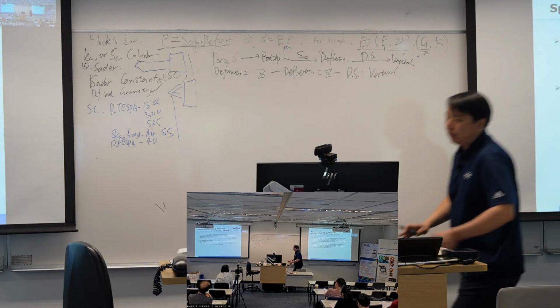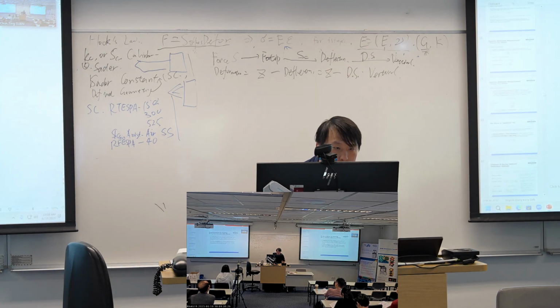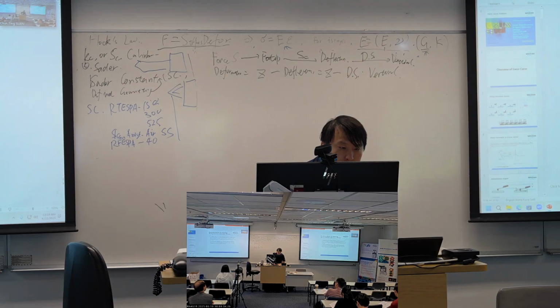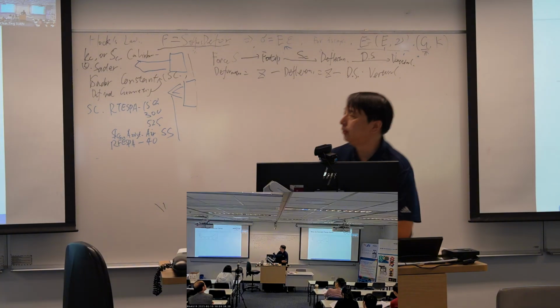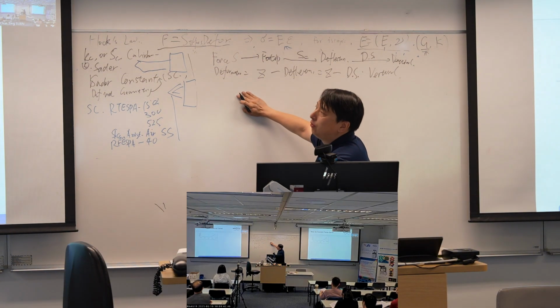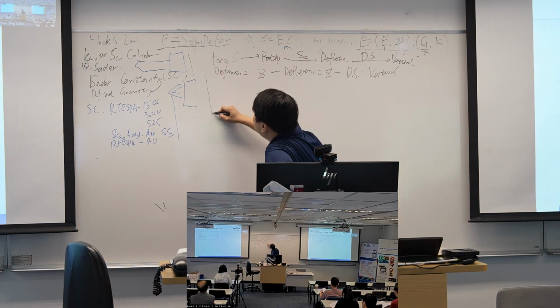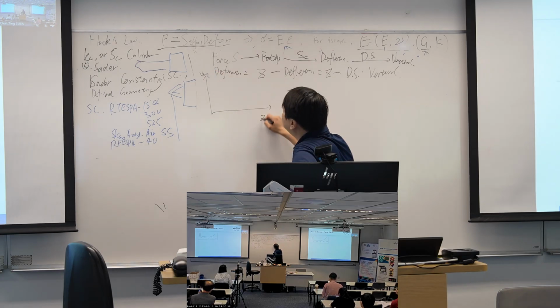So we can play the games. Like this, we have our original force curves, and the original force curve is vertical over Z.